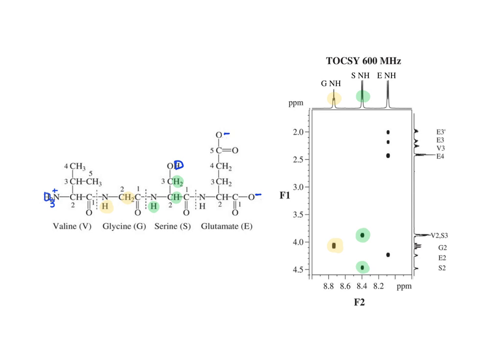And then for the third amino acid, this NH, which is connected to a C2 hydrogen also correlates with clearly diastereotopic methylene, and then another methylene group with the protons much closer together in chemical shift. And that fits a pattern for glutamate.